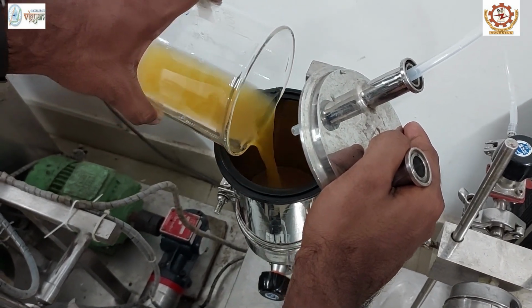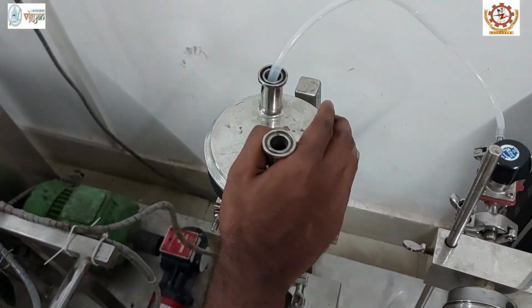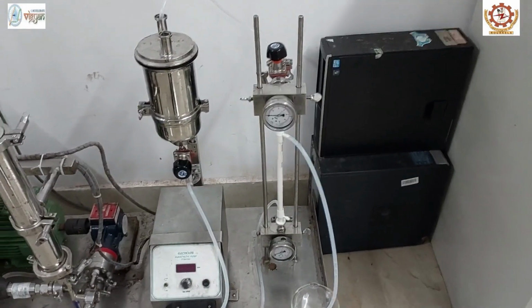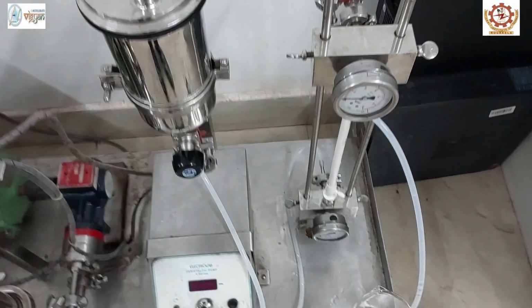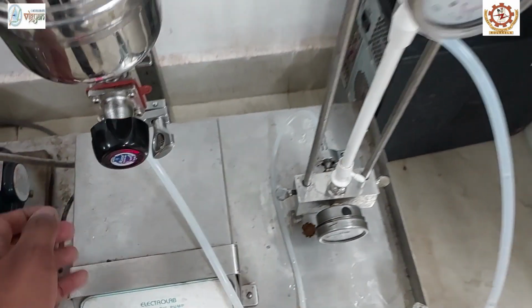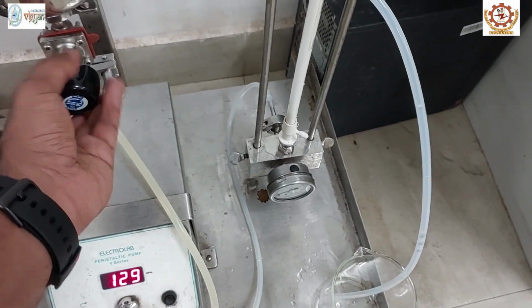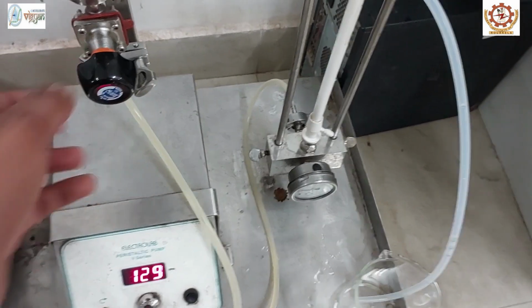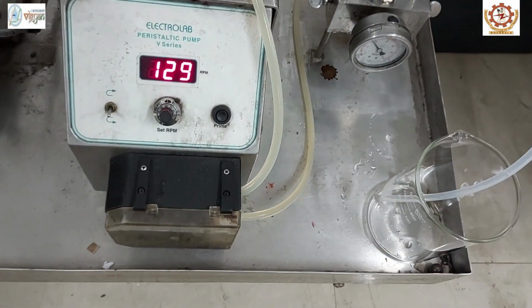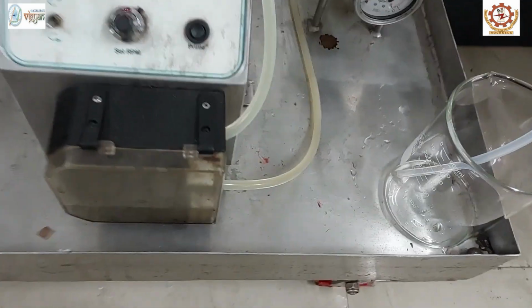You can see the color of the fruit juice. It is highly turbid. Once the juice is fed, the peristaltic pump should be turned on, followed by opening of the inlet valve. You can see the juice is passing through the silicone tube with the help of the peristaltic pump.